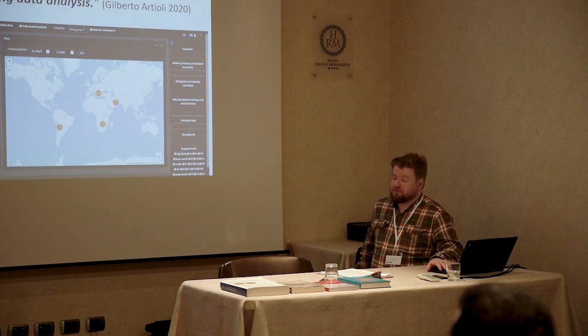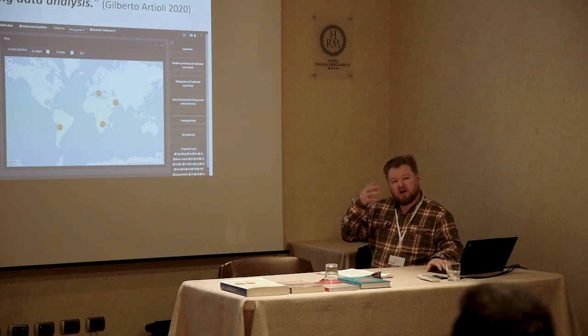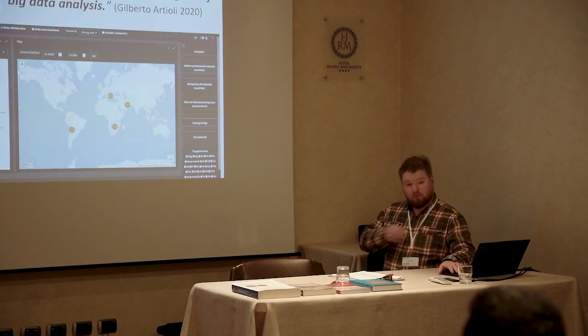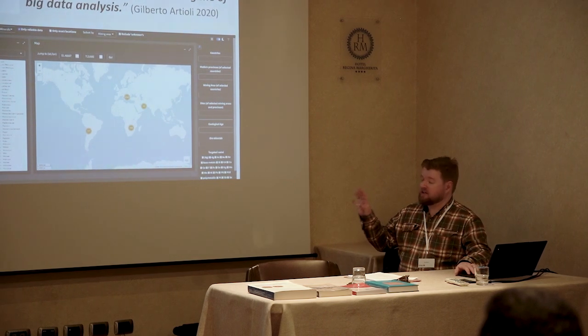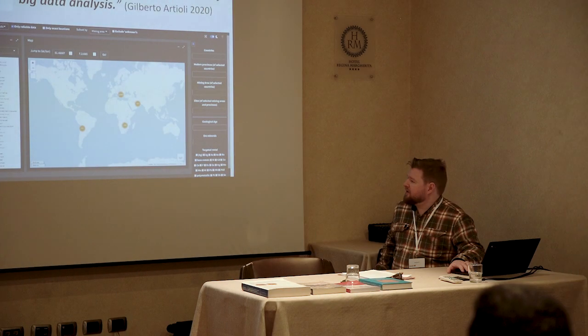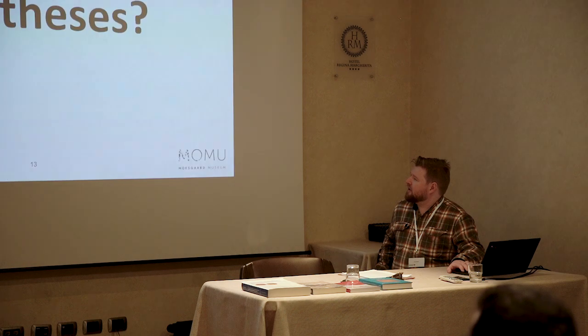So this is nice to use. There are other data sets to use. So we have a large reference data to draw on from all over the world, especially in the Mediterranean. We're looking at Mediterranean and Europe, points of interest for us, something in the order of 7,000 to 8,000 raw data points.